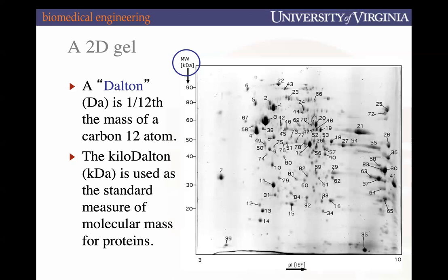Typically, the SDS buffer that you use when running SDS-PAGE in general is encasing the entire gel as well. And so when you separate based on charge, what's likely also going to happen is that there's also the buffer that it's in that'll also add a negative charge after they've already been separated.